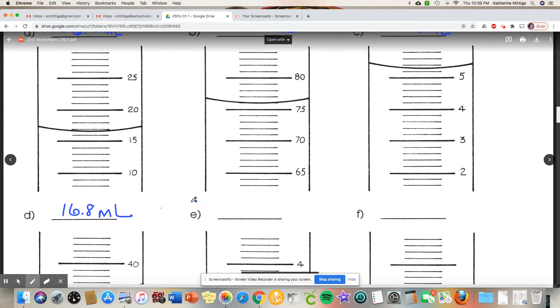Okay, so it looks like each of these are worth one milliliter. Here's 75, here's 76. Don't leave it as 76 milliliters, we have to estimate one beyond. So if each of these are written to the one milliliter, we have to go to the next decimal place. So that's right on the line, so it's gonna be zero.